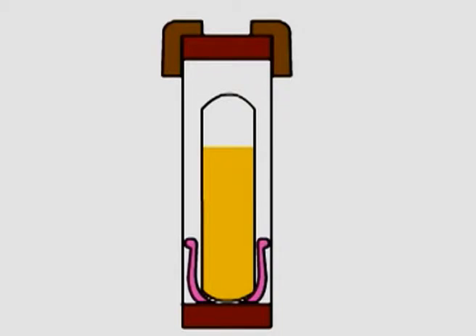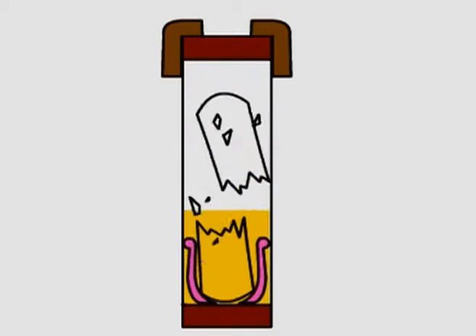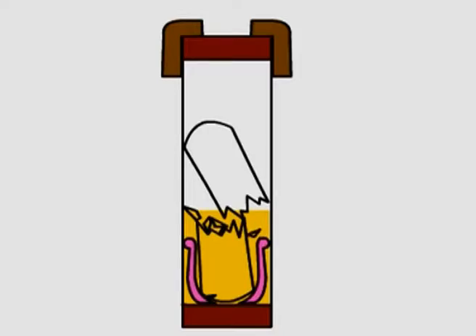After the completion of the autoclaving process, this ampule is broken aseptically and allowed to grow in an incubator shaker for a definite period of time. If we see that there is no growth of bacteria, then we can say that obviously all the spores have been killed during autoclaving. And it means that the entire process carried out during autoclaving was a perfect one.